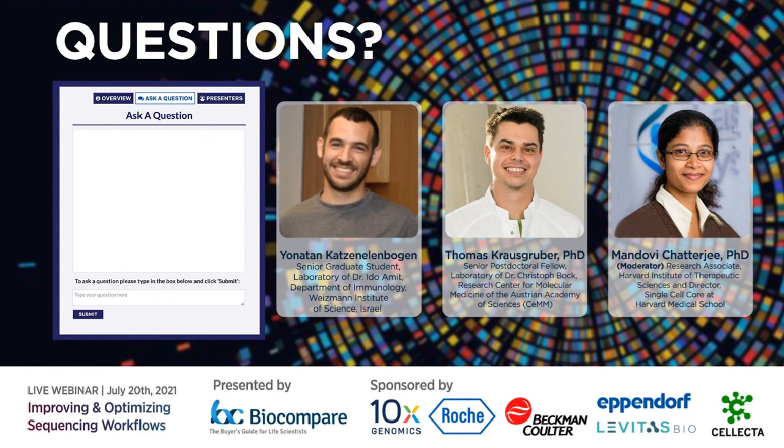Anyway, yeah, it's super expensive to sequence, so you better have good quality material before you do.